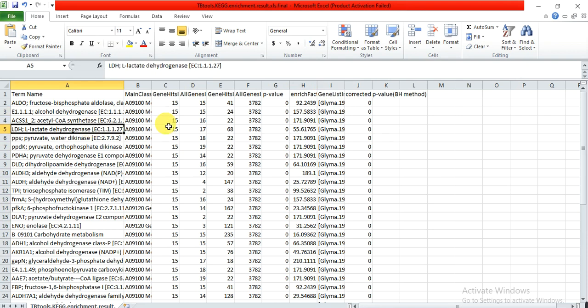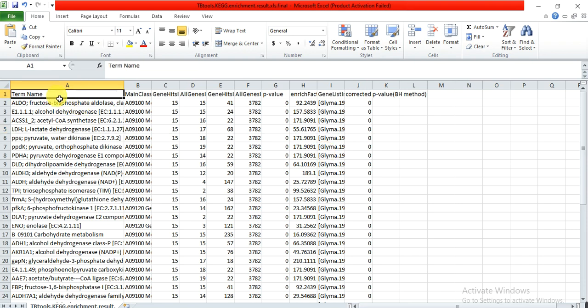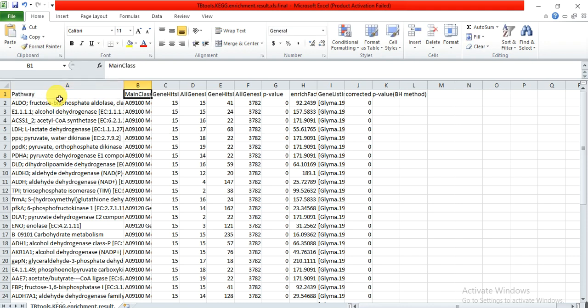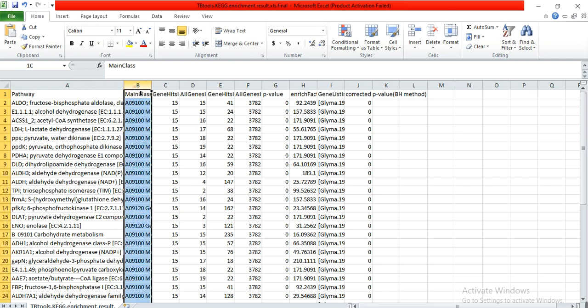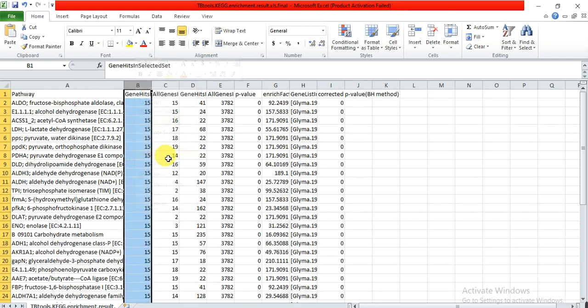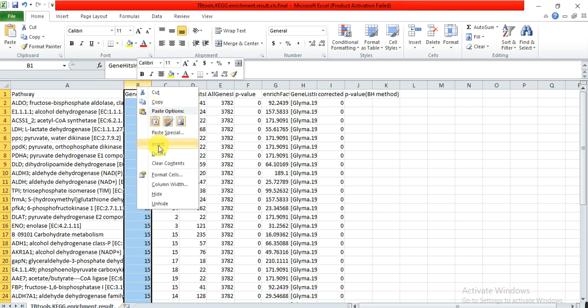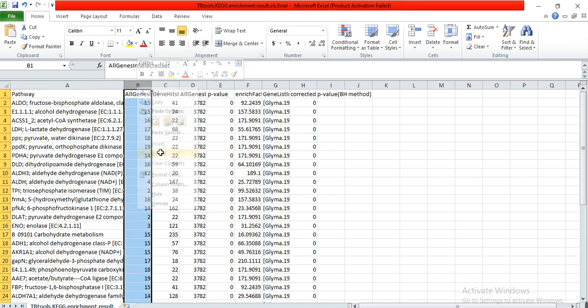For constructing the bubble plot, we only need the pathway, enrichment value, p-value, and gene name. We name this column 'pathway.' This is the main class - we didn't need this, so we delete it. This is the gene hits.